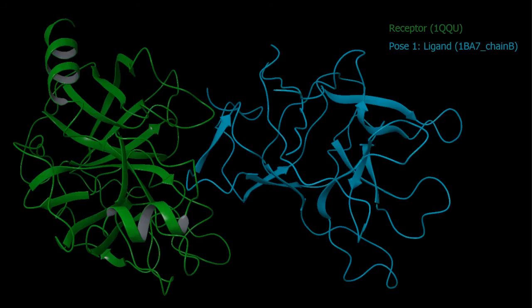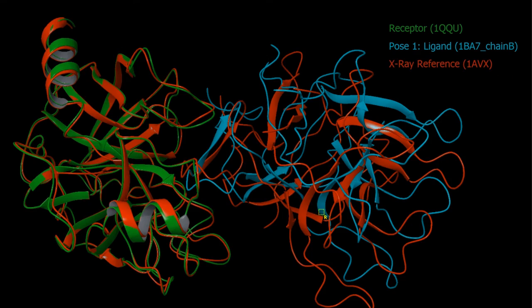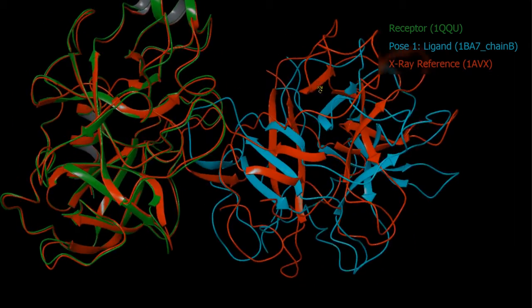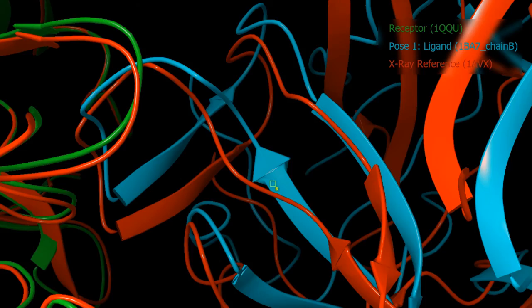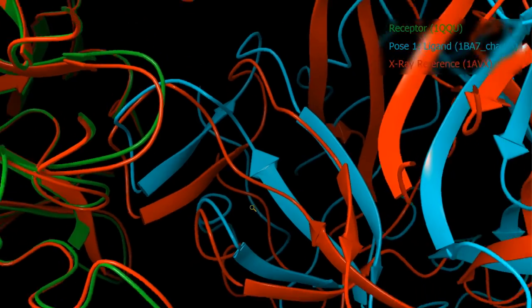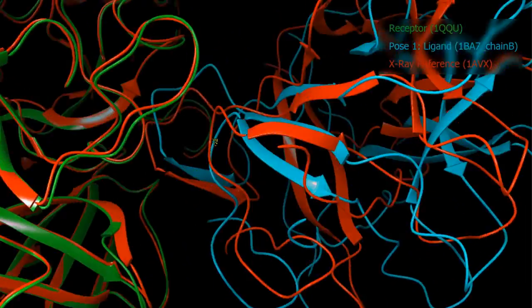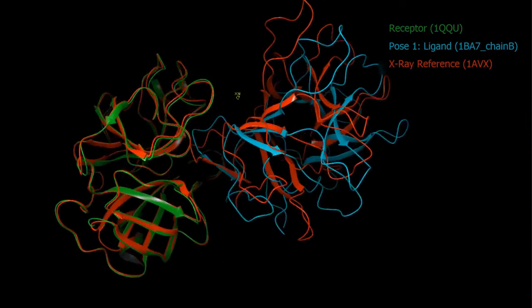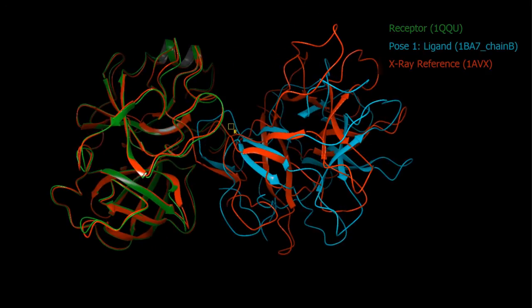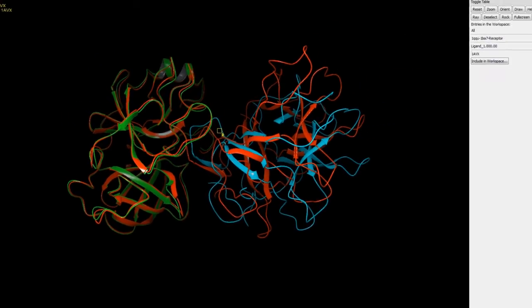It just so happens that there is a crystal structure of this complex — although it contains a couple of different mutations — that protein is 1AVX. I've already pre-aligned chain A of 1AVX onto 1QQU, which allows us to directly compare the pose of 1BA7. It's clear that the top predicted pose did bind into the same region as seen in the reference crystal structure, so this is not a bad result. However, the docked pose is displaced and rotated somewhat from the reference, which is due to the docking algorithm. Ultimately this shows the level of accuracy you can expect from protein-protein docking.